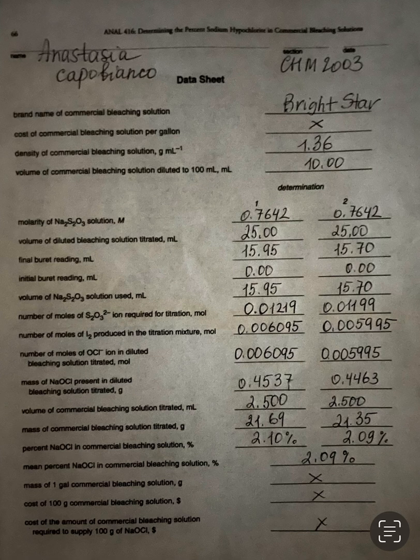Molarity of our sodium thiosulfate solution. I created this molarity, right? For you, it was given on the bottle. Just make sure to use that number correctly.